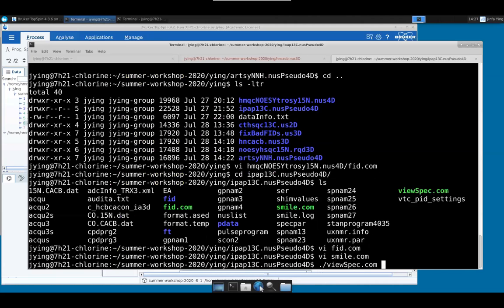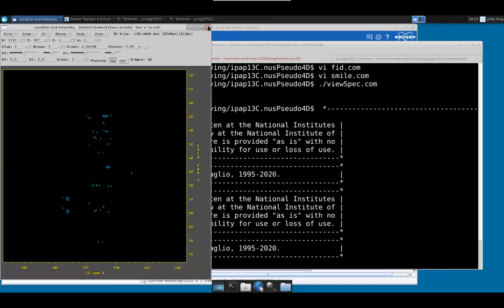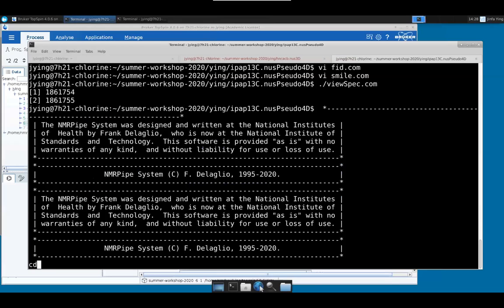If you look at that, you see that it's not a nice data set, but it's there, okay? The peak is detected and it's in the right position. I think the user was just testing and got into trouble, couldn't process it whenever he runs NUS, while the whole thing works when it's fully sampled. That's really it for the demo.